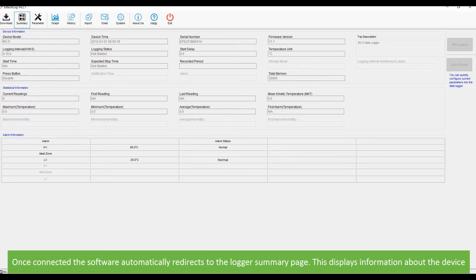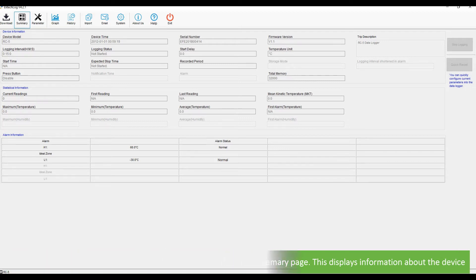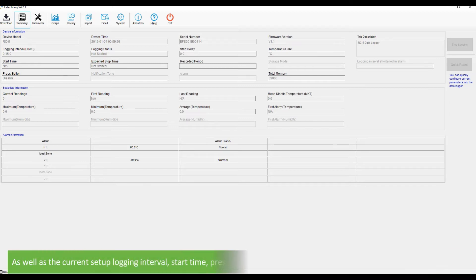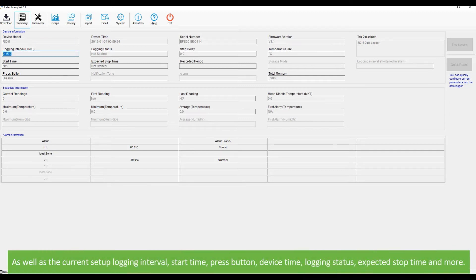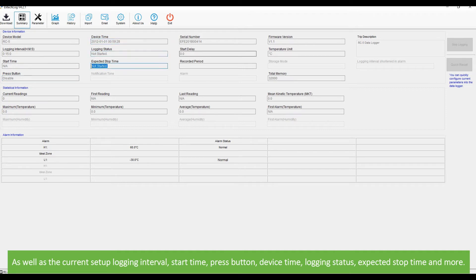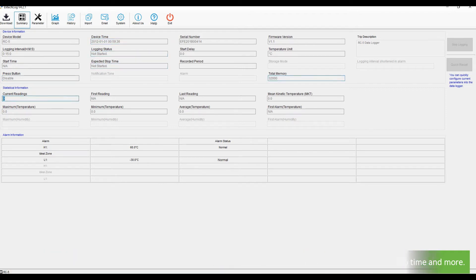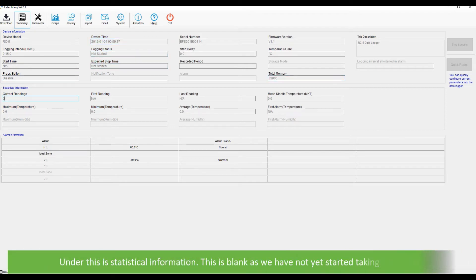This displays information about the device as well as the current setup logging interval, start time, press button, device time, logging status, expected stop time and more. Under this is statistical information. This is blank as we have not yet started taking readings.